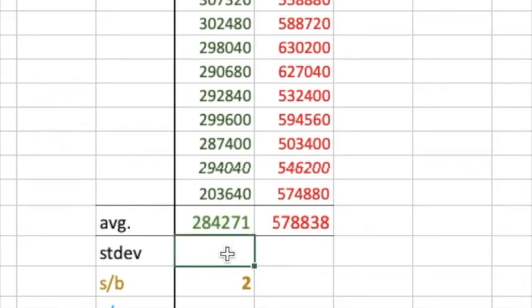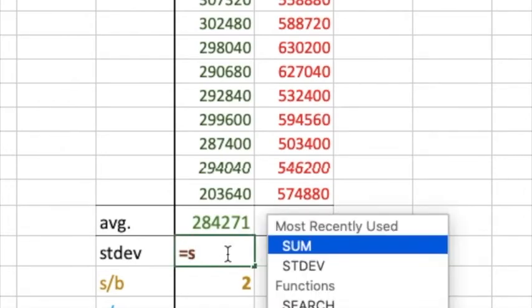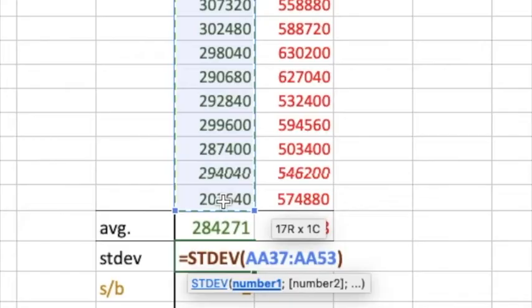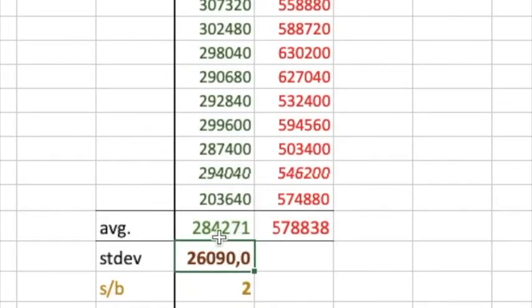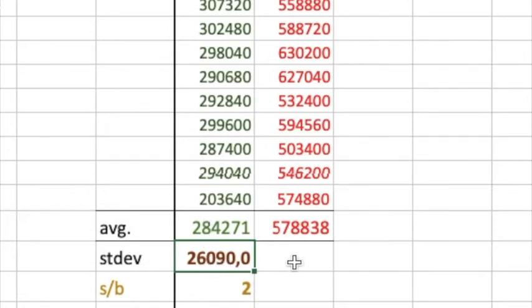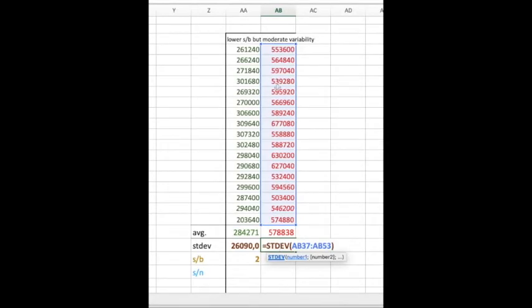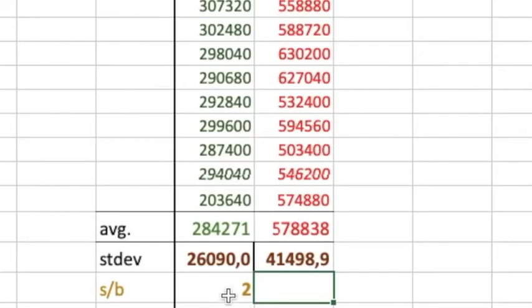You do equals and start to type 'standard deviation' — it comes up, drag it across, hit enter. It's telling me that for my 284,000 average, I have a standard deviation of 26,090 variability. To get it for the positive control as well, come to the cell until the cursor turns black and drag it across — and it's calculated it. That's a quicker way instead of doing it all over again.